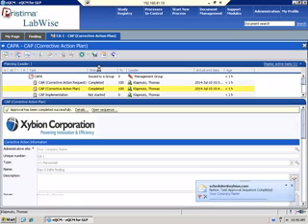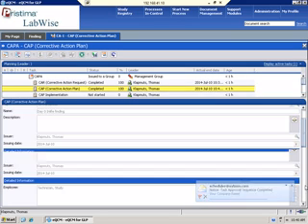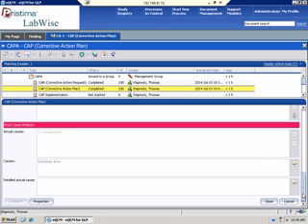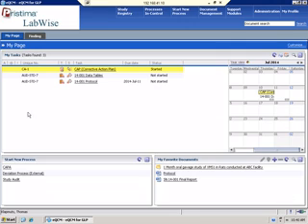So now that it's approved, I'm able to complete the task. And again, you see the email notification, so everything is available and communicated. And so now my plan, once it was approved, it was automatically completed. I can't go back in and change anything. Okay.